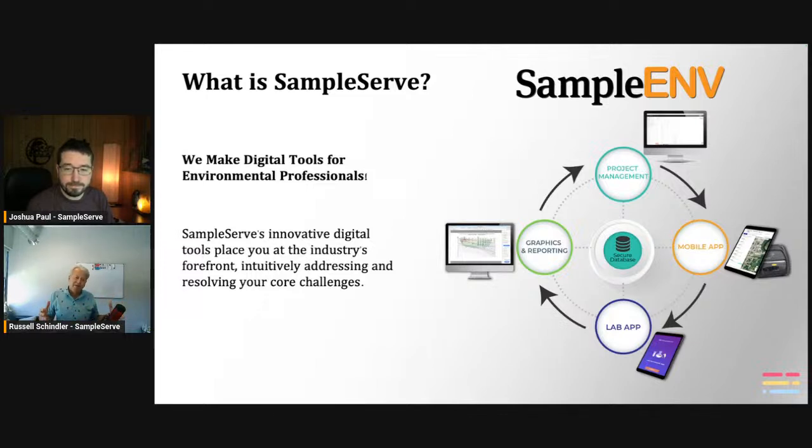And it really just allows you to open up and maybe go on to the next well, open it up, find it if you haven't found it yet, do a bunch of other things. And even as Dave mentioned, there's a couple of innovations that could occur to make it so you can do 2 wells at the same time and record the data and not lose any quality. Right.